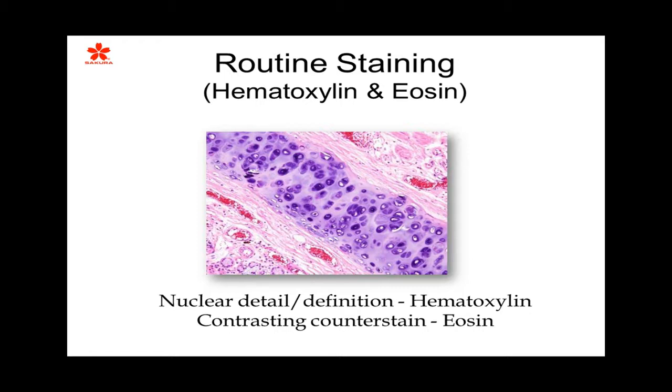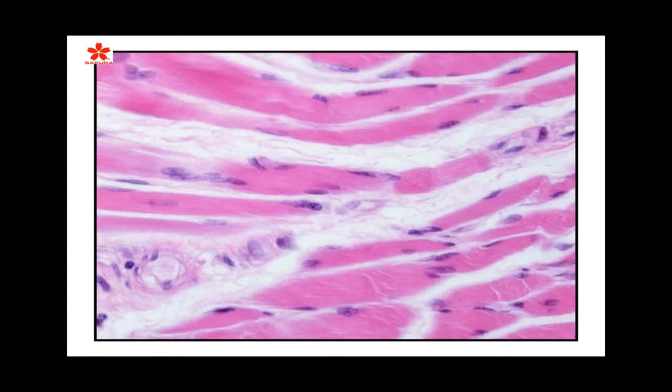What you can also see is red blood cells staining. These are very, very bright red, if you can see. I don't know how it appears in your resolution, but the question was, did we use phloxine? And this is the point that I want to make going into this. Normally, to get red blood cells or tissue elements this red, you would need to use phloxine, but by the way that you can manipulate your H&E stain, you can actually get rich staining as if you were using phloxine just by using something like your regular alcoholic eosin. So we want to talk about that today too, a little bit later.